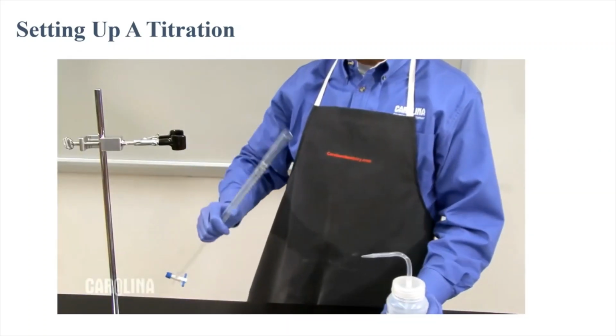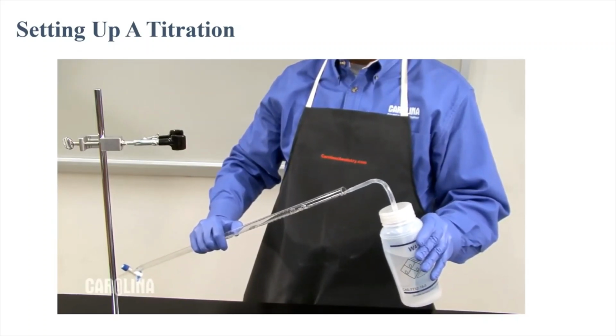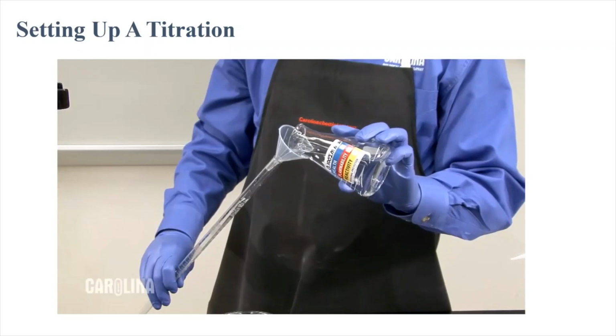To prepare your burette for the titration, it is good laboratory practice to rinse your burette thoroughly with deionized water, then with a small amount of titrant.